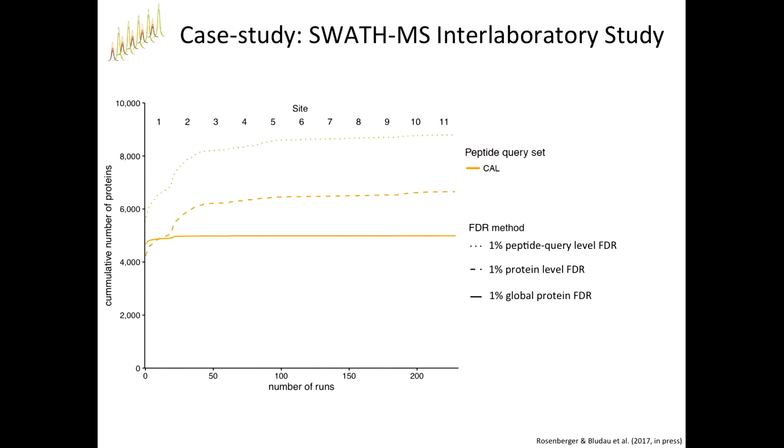In general you need a fair amount of peptide queries, the size of your assay library, to be able to look at distributions, right? If you have too few, then you don't have a distribution. I'd say probably hundreds should be in there, but this is really a question where opinions diverge a little bit.